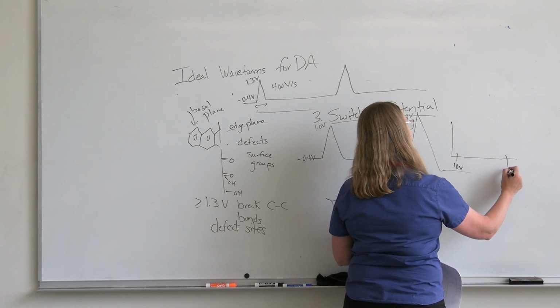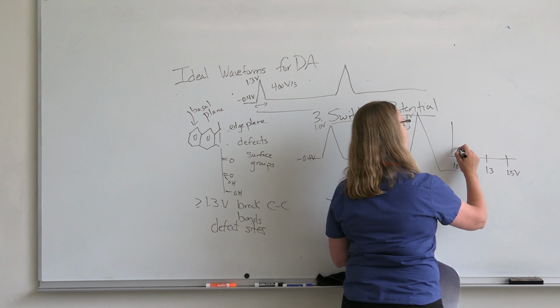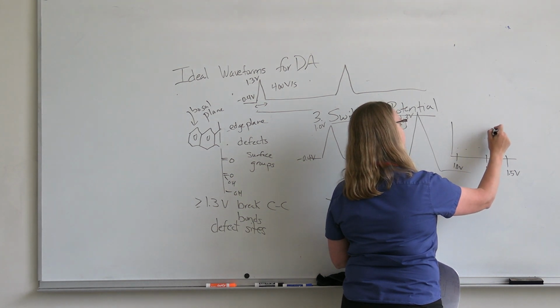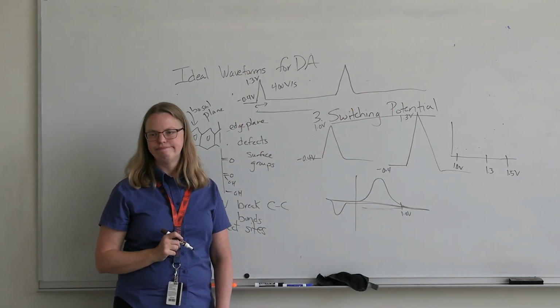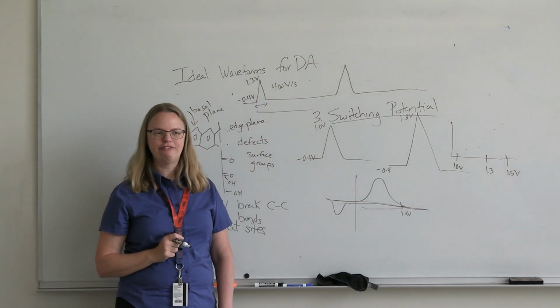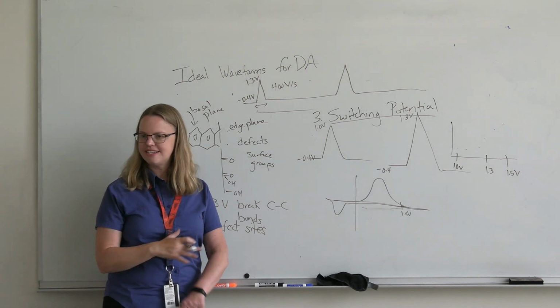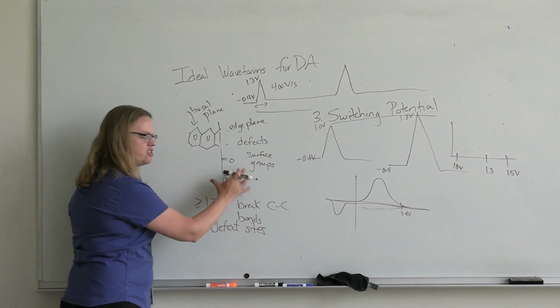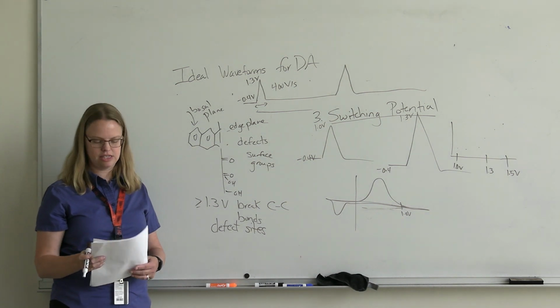Again, it's very electrode dependent, but oftentimes the points will be a little bit low and then jump up with the higher ones. That's a very approximate graph. There's no equation that tells you what it should look like. It's more of a jump: did you get enough voltage to fundamentally change the surface?